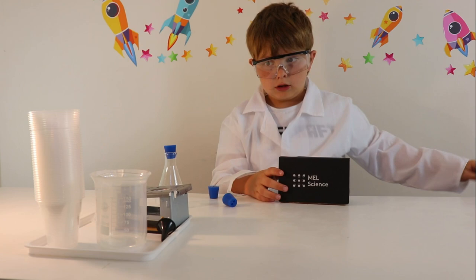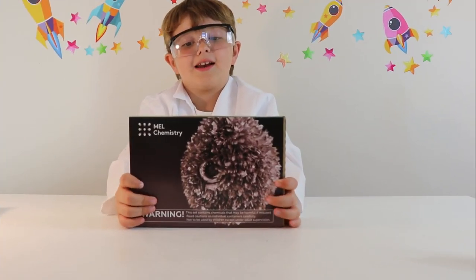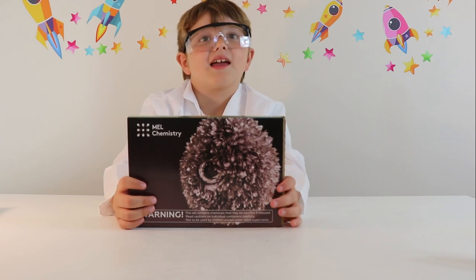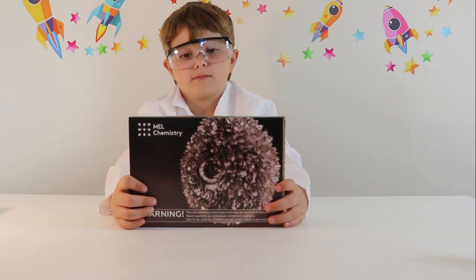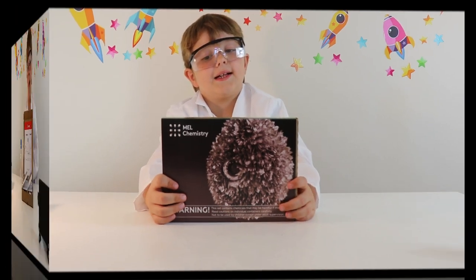Shall we make a start on our first experiment? So guys, we are going to do the Hedgehog, aren't we Mummy? Yeah, so with our starter kit our first experiment is tin.